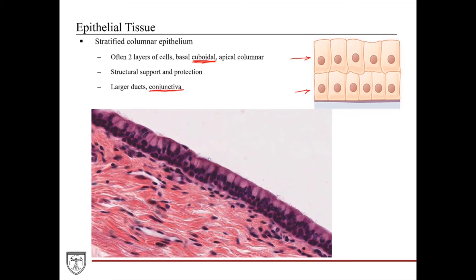Here's the conjunctiva — here's the epithelium and here's the connective tissue underneath. The basal cells are cuboidal in shape, and their nuclei form a nice row in the basal compartment. The apical compartment has true columnar cells that are staining pale, because this compartment is filled with mucin — a mucous-like material secreted by these cells onto the surface of the tissue to keep it moist and protect the underlying epithelium. These mucin-filled cells are also known as goblet cells. So in addition to structural support and protection, we can also add secretion to the functions of this epithelium.